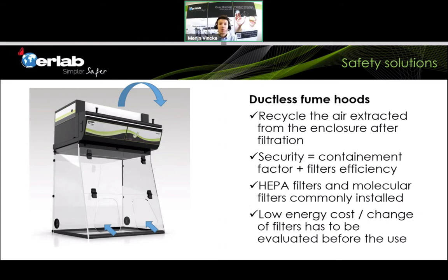If you would use powders or particles, they will be captured by particulate filters such as a HEPA or an ULPA filter. So this is really completely different technology, which has a lot of different advantages compared to a ducted fume hood. But the main principle is that it keeps you safe, again, by a good containment.